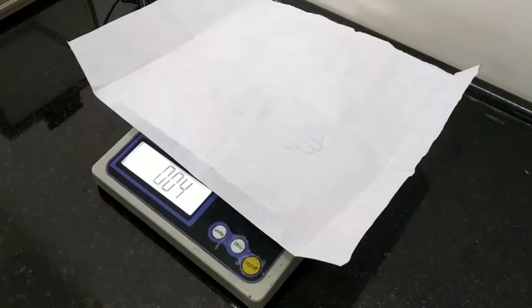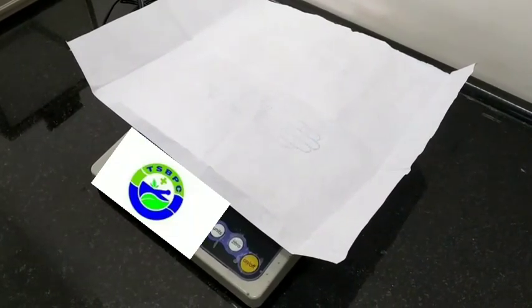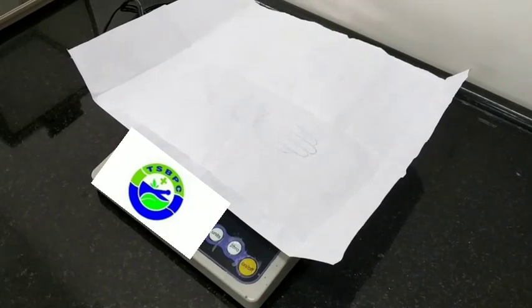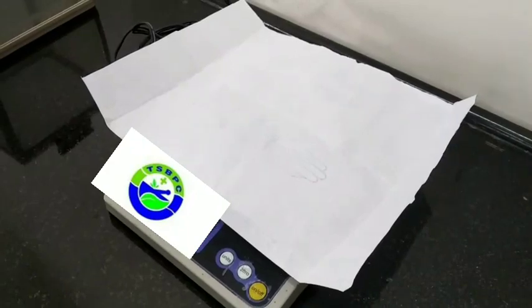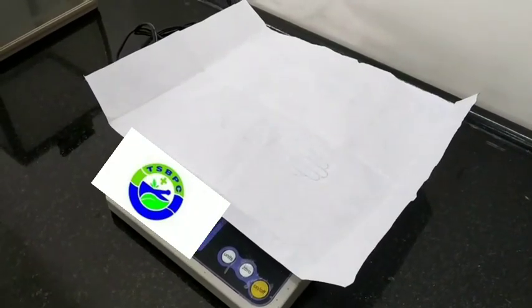Now let's see the procedure. For that we will mix a weighted quantity of zinc oxide and calcium hydroxide. We are measuring zinc oxide 32 grams.